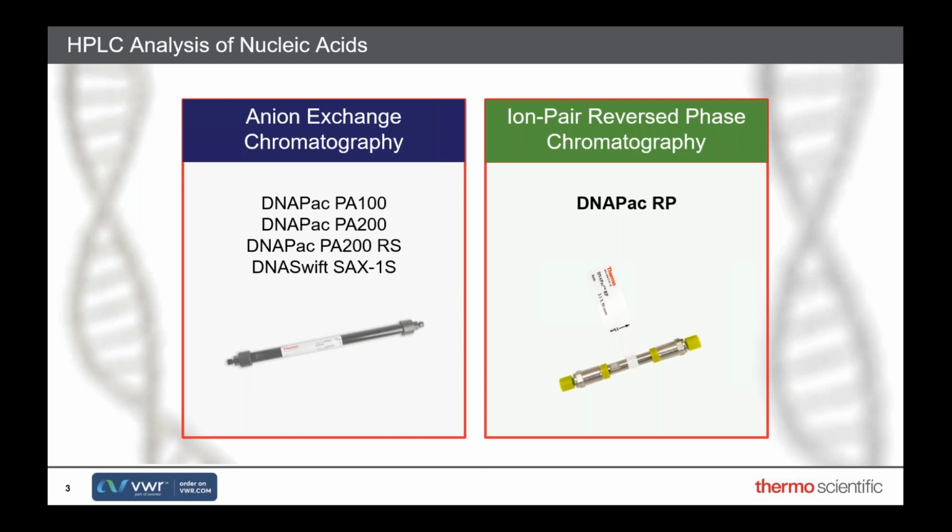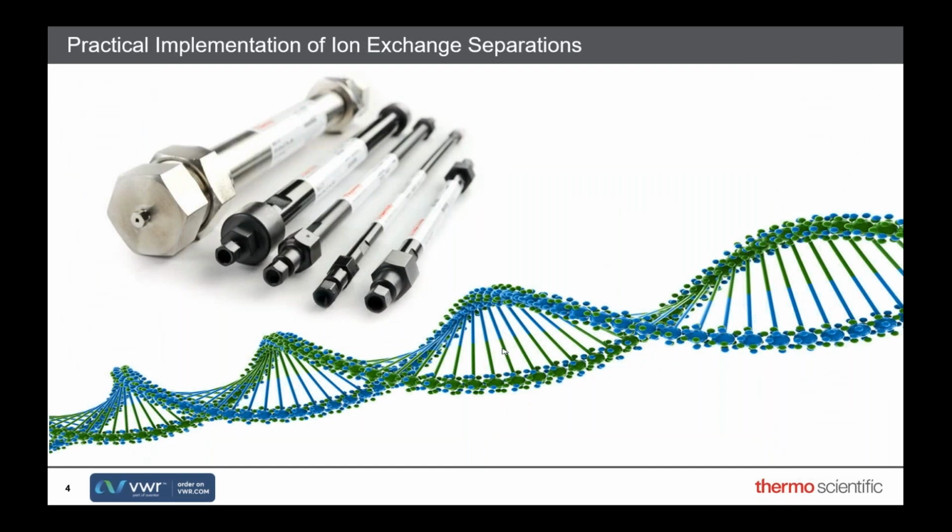Those amine ion pairs will contaminate the LC, the tubing, and anything that goes into the mass spec, your transfer capillary. So usually these systems are dedicated to this analysis. I'll show you how you can get around that a little in the further separations.